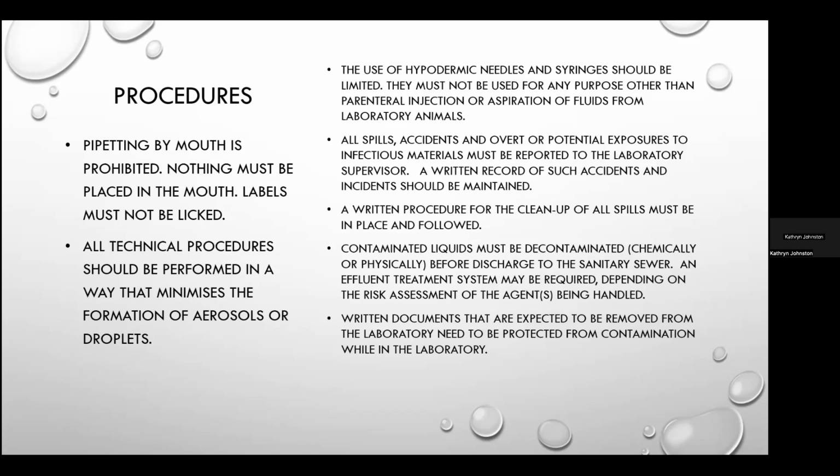And then another component is the contaminated liquids. If you are on a sanitary sewer system, in other words, if you're connected to a sewer system, then contaminated liquids should be disinfected prior to disposal. If the laboratory in which you work has a septic system, a septic tank, then decontamination of liquids can affect the septic system, and careful consideration has to be taken as to which of those are applied to prevent killing the microbes in the septic system.